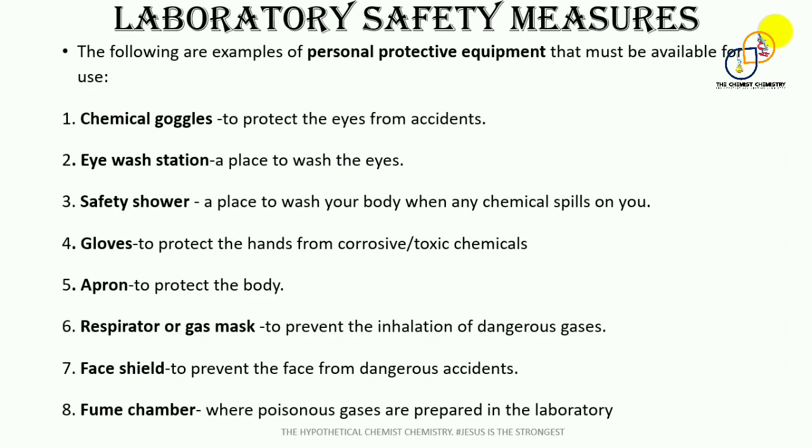Then we have eight, being the fume chamber or the fume cupboard. That is, the chamber is a place where poisonous gases are prepared in the laboratory, and it is designed in such a way that it will capture and remove airborne hazardous substances generated during laboratory experiments.